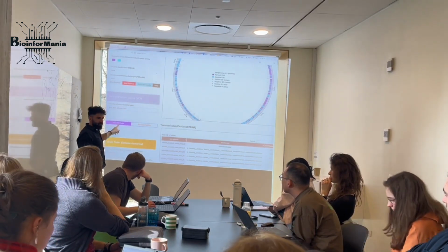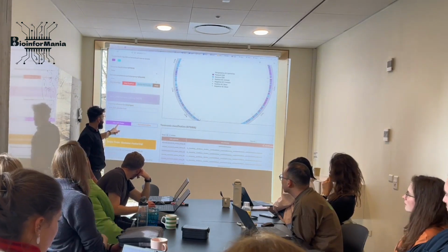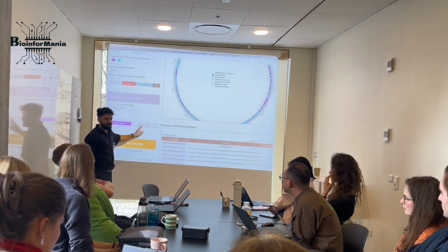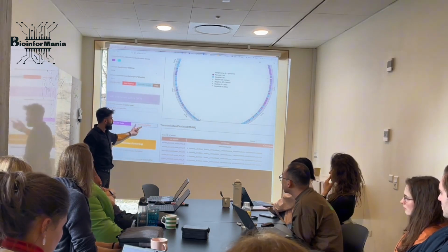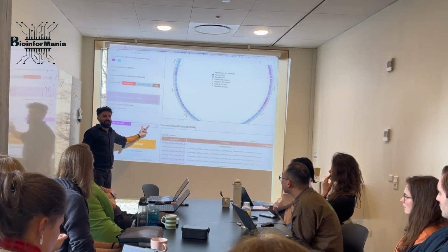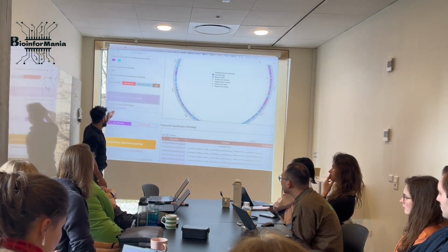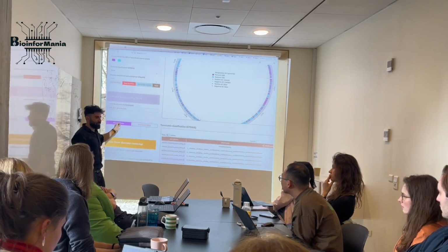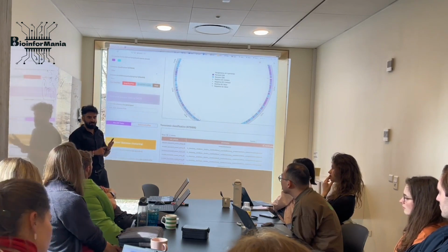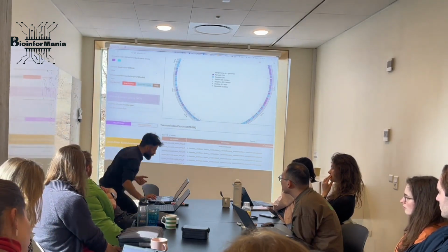If you hit this, you will find these single nucleotide polymorphisms, and if you want to see all the variants, structural variants, transitions, transversions, insertions, deletions, you'll run this. It doesn't show anything, but if you go to this output folder, you will find 2 folders, SNPs and SVs, structural variants, okay? And over there it will show you.